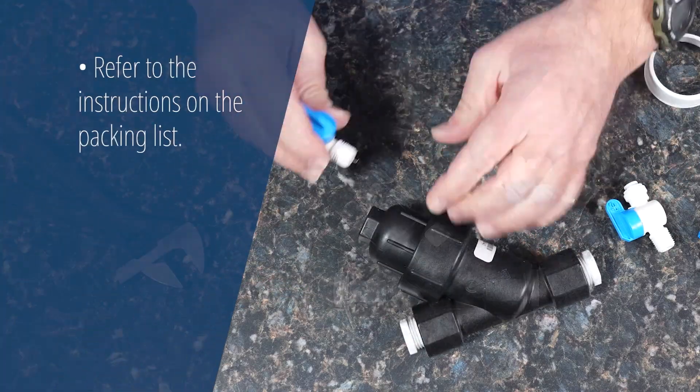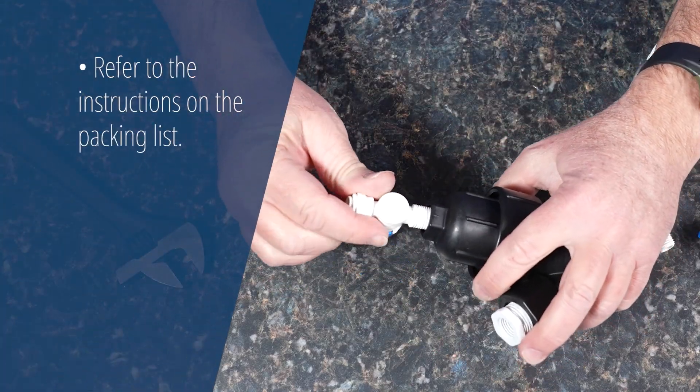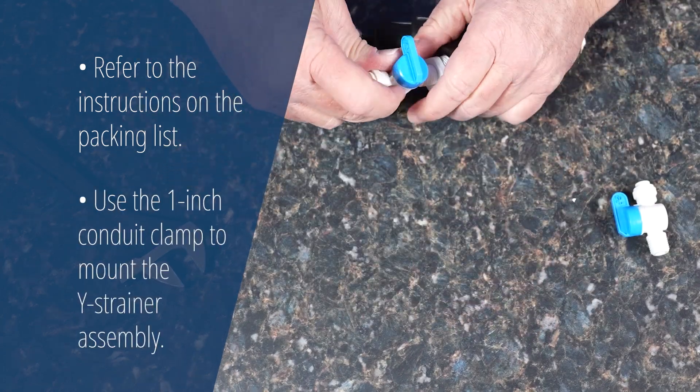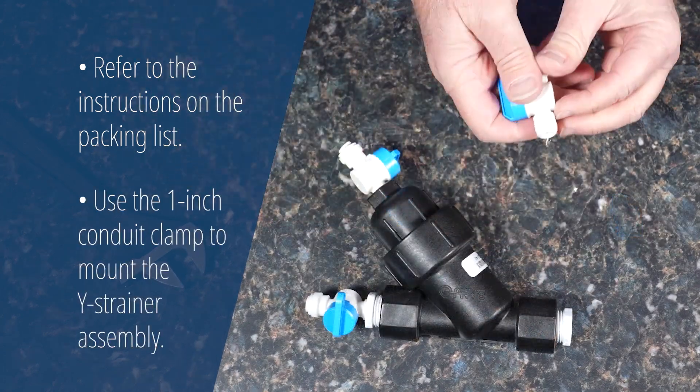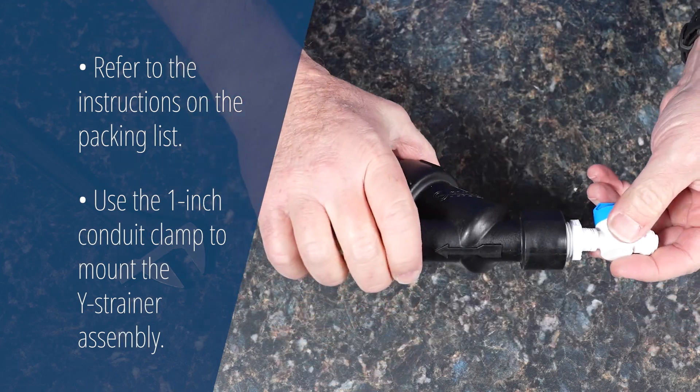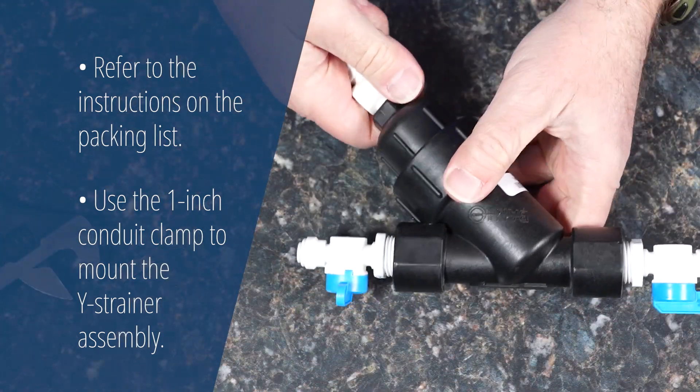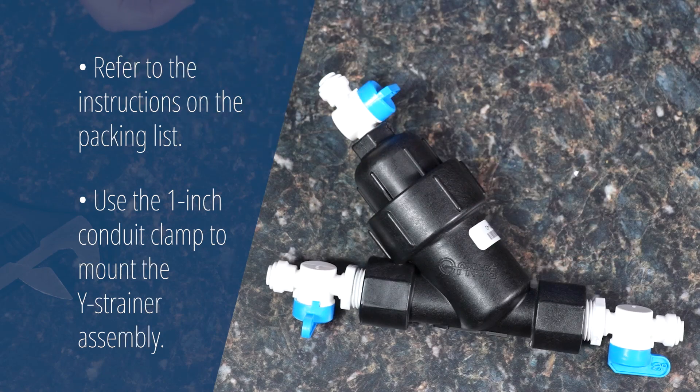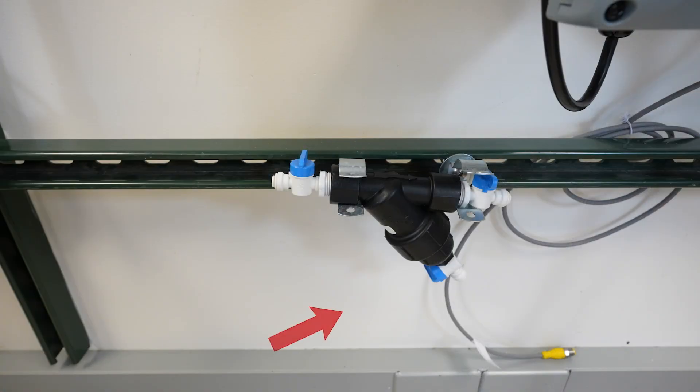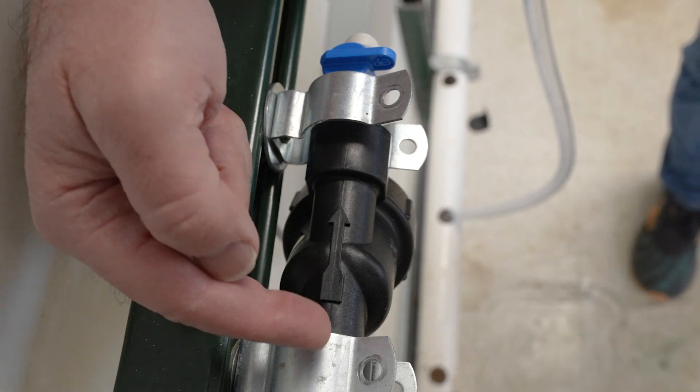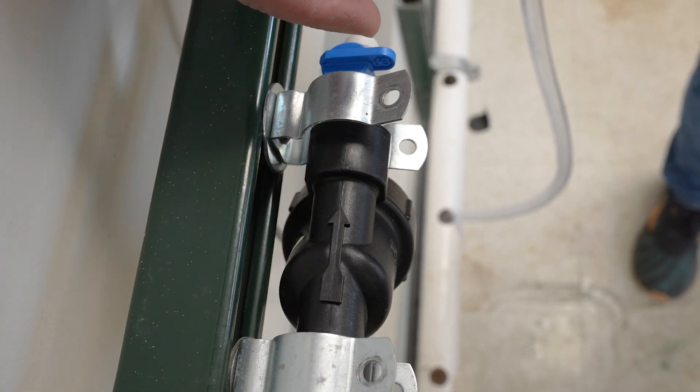Assemble the Y-strainer before you begin installation at your location. When you install the Y-strainer on the wall, make sure that the angled bypass port points down. Make sure that the flow arrow on the Y-strainer points toward the analyzer.